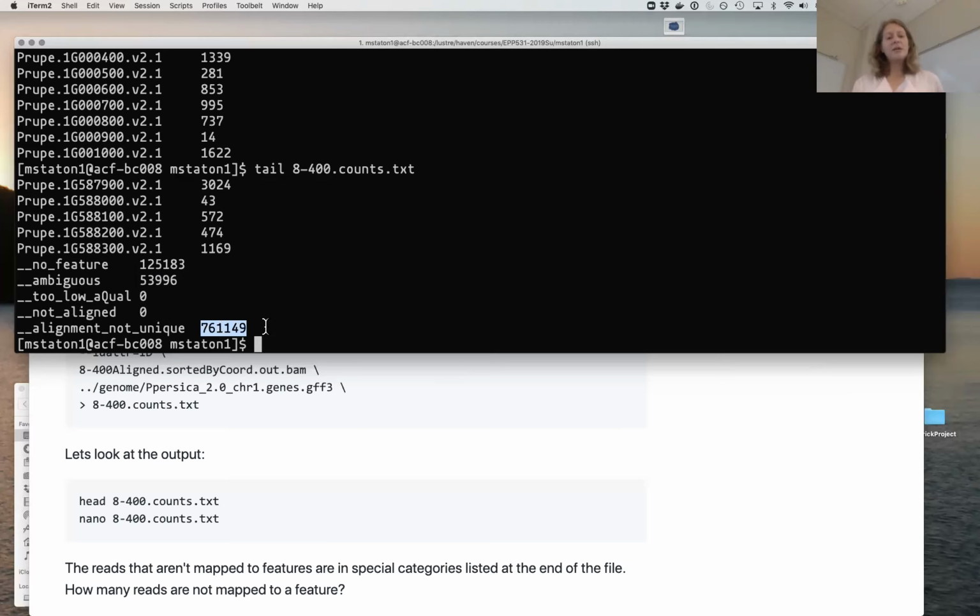It's our biggest amount of read loss, and that's almost 1 million reads. That's a lot of reads to lose. But this just goes to show you that genes oftentimes have regions of high similarity with each other, and so if those reads can't be mapped uniquely, for the purposes of this pipeline, we're going to end up discarding those and not using them. So something to look out for, certainly, especially if you're particularly interested in a region where your gene is highly similar to a lot of other genes.